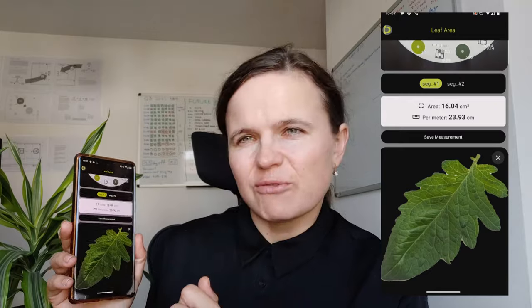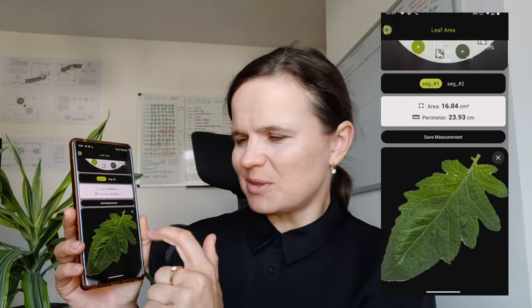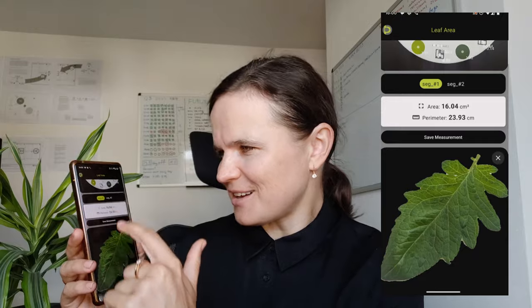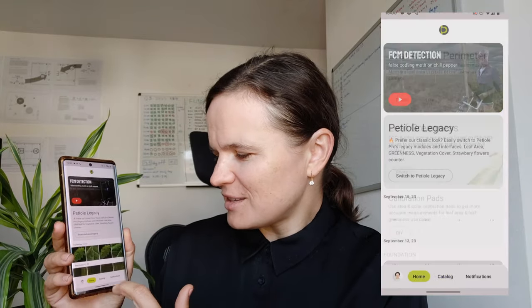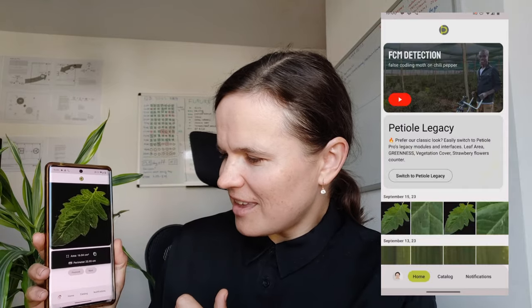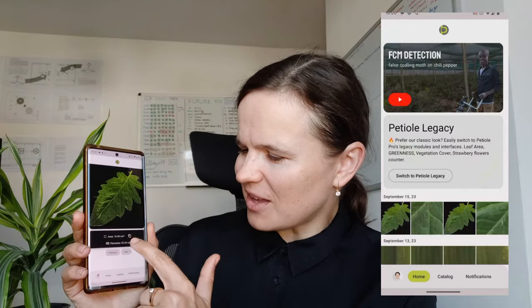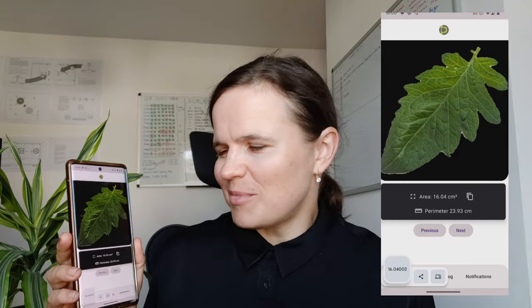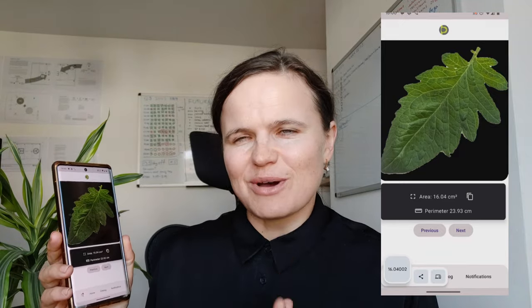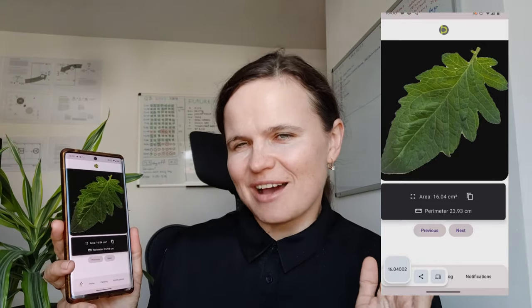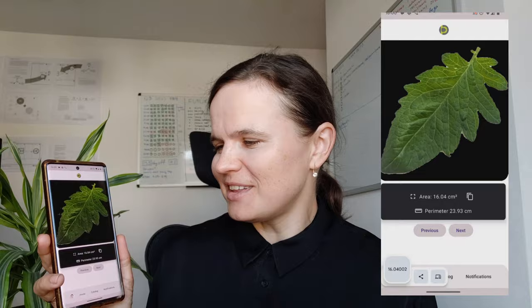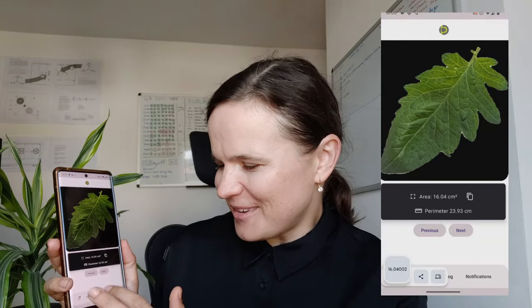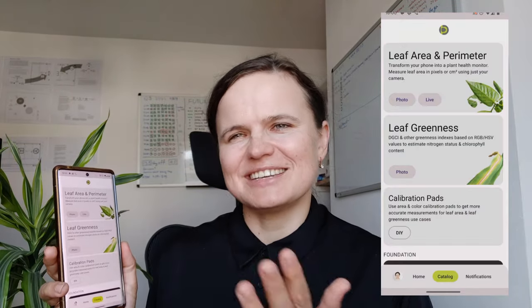We need to go back to segmentation number one and double-check it. Yes — here the full leaf is captured. So now all we need to do is save the measurement. The job is done. Let's go home and check what we have. Here is our measurement — you can copy it and use it whenever you need, and put it into your chart or table. This is one of the core processes of how to use the leaf area module, and if you master this process, you are almost done — this is the basic.